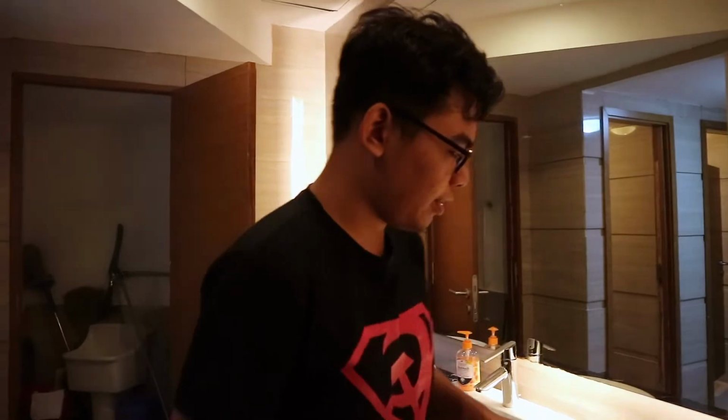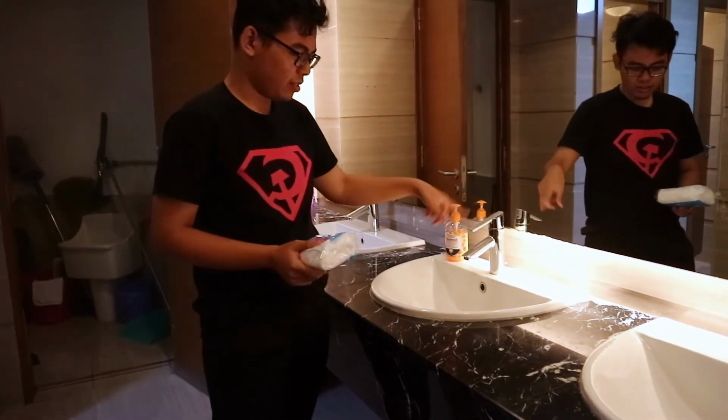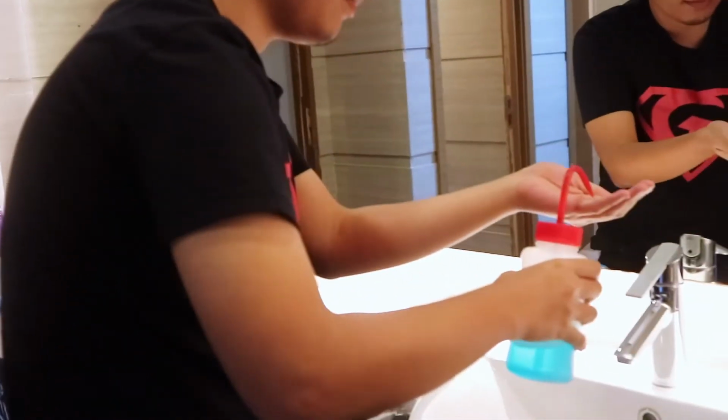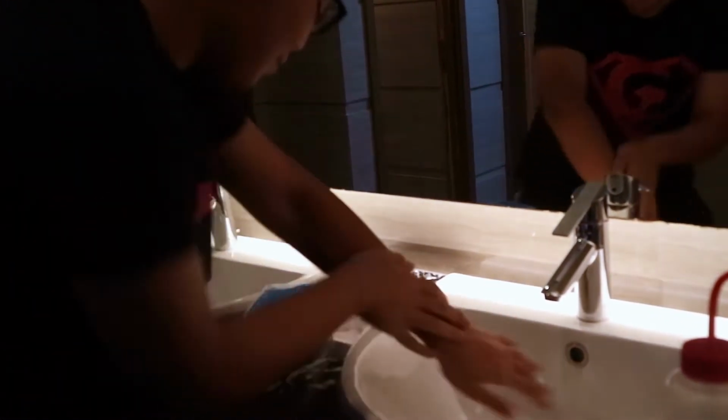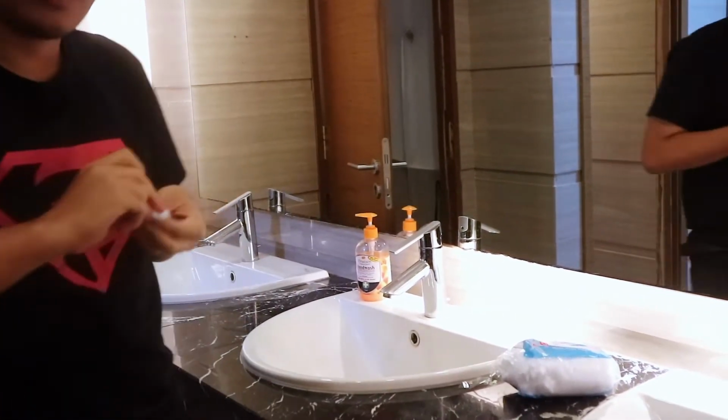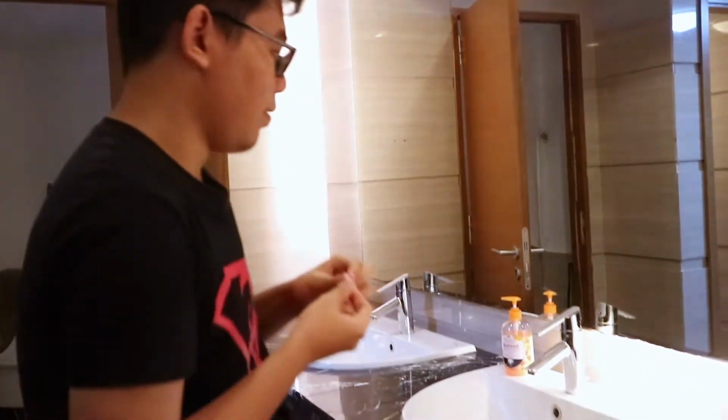Okay, we're here in the boys' bathroom, toilet. I'm very interested in the faucet, you know. People think that since people wash their hands with this, it must be sterilized. I don't think it's sterilized. Let's see first. A small piece like this. My hands are sterilized with alcohol, so it's safe to touch this. Okay, watch.